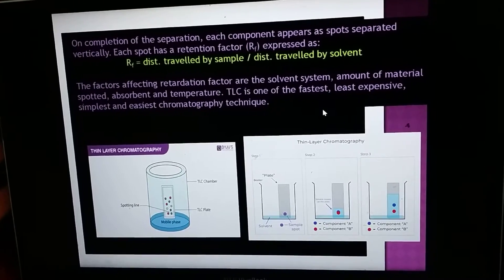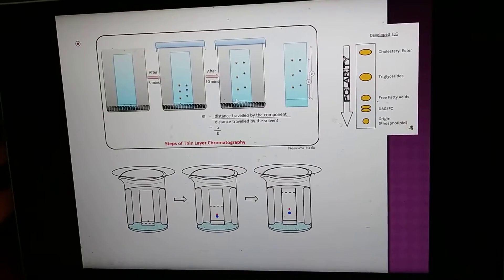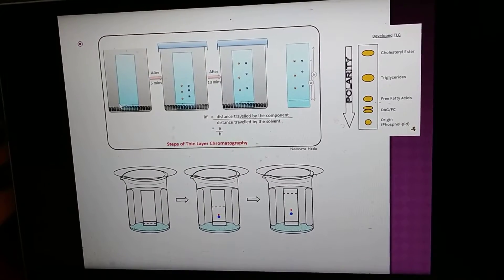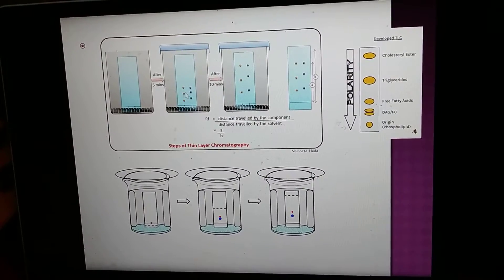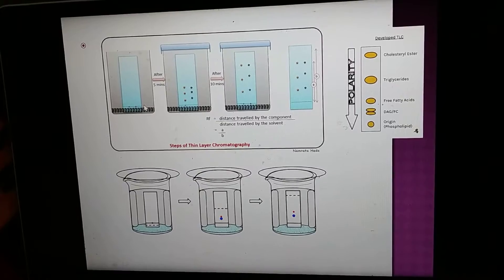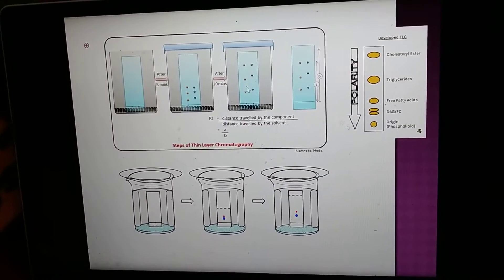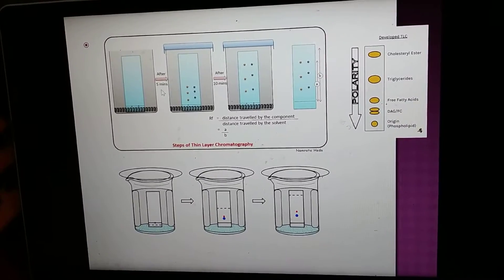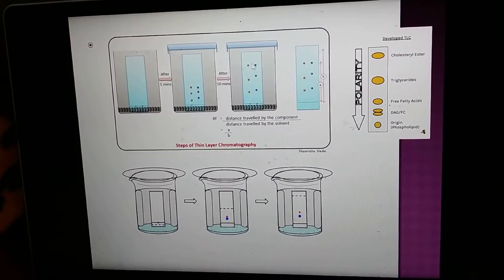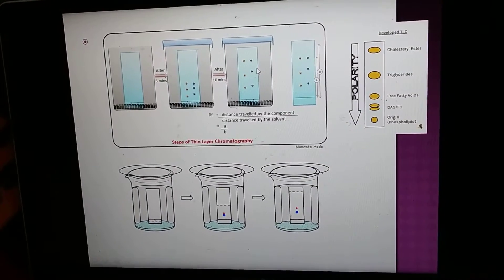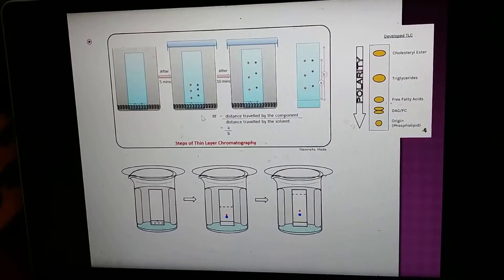Looking at some practical examples — the baseline has two spots, one containing three compounds and another also containing three or four compounds. If you want more RF value difference between two spots, running for five minutes may not be enough. Running for ten minutes will separate more finely — the distance between compounds will be higher. Running for fifteen minutes may cause spots to cross the solvent front line.